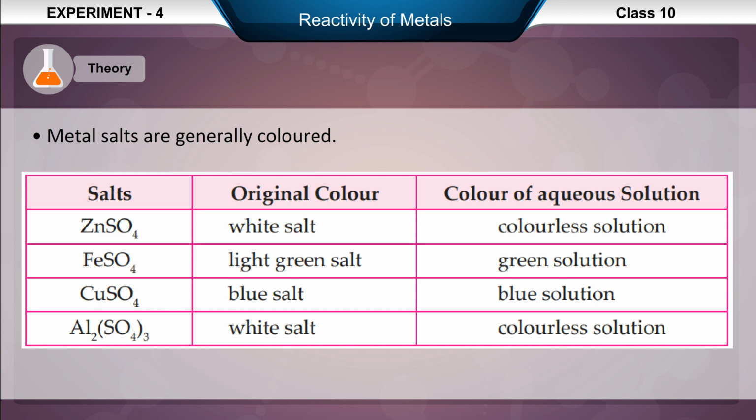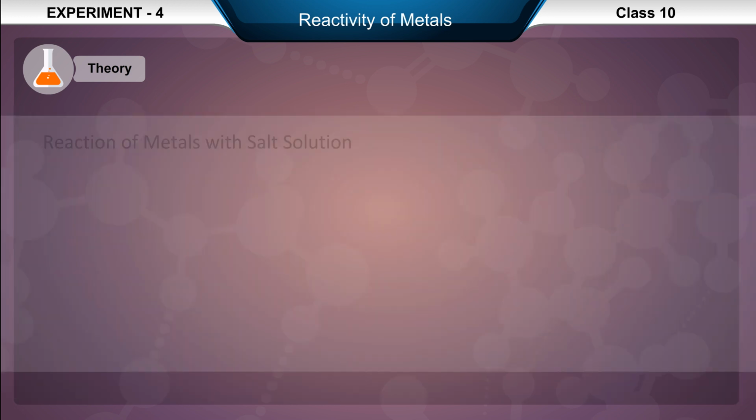CuSO4. Original color: blue salt. Color of aqueous solution: blue solution. Al2(SO4)3. Original color: white salt. Color of aqueous solution: colorless solution.